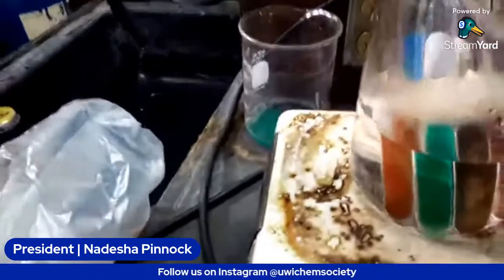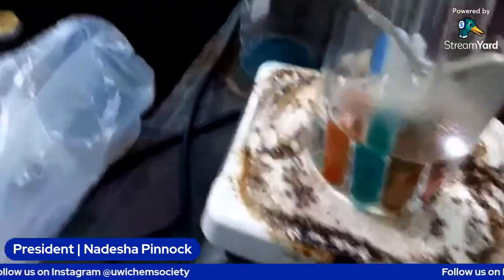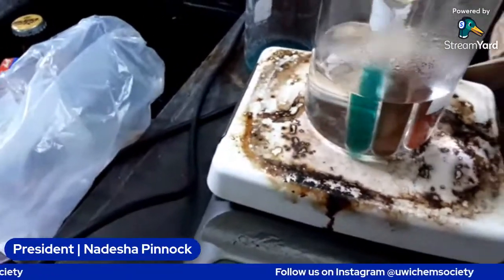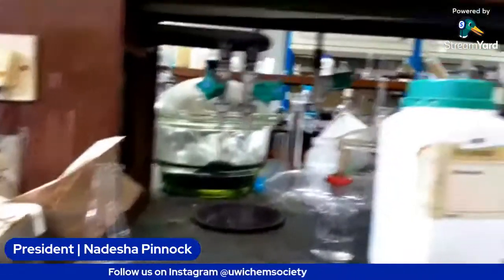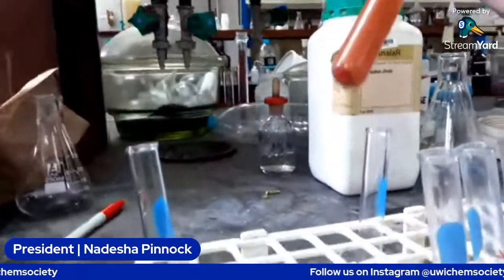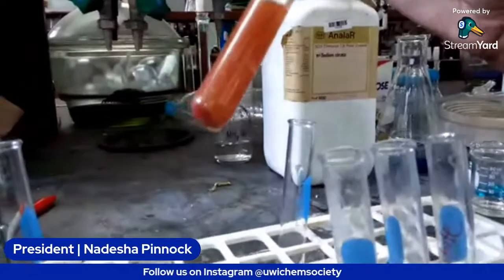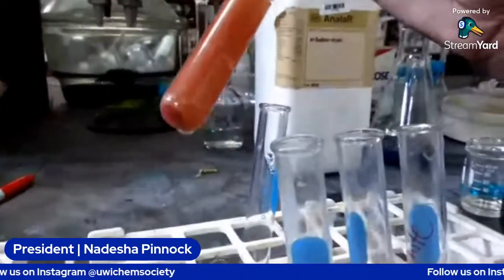We can label it again and do it one more time. It didn't take long. So let me just show you guys. This one, there's a precipitate in the bottom of it. You should be seeing the brick red precipitate. Can you focus, man? There we go.